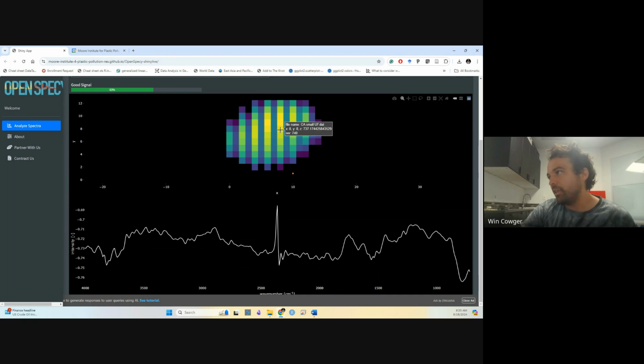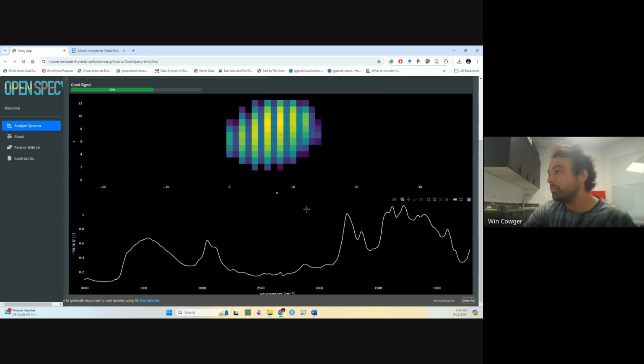And then the last piece of it is baseline influence, which we're not really thinking about too much. Actually, we're using the baseline here to find where the particles are, because the baseline is going to shift too. Wherever the particles are, the baseline is going to go way up. So it's a helpful thing in this case.